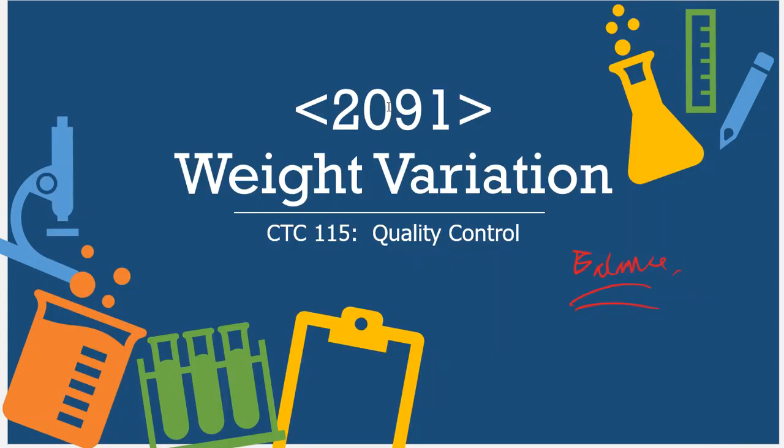All right, so that one's now finished. Weight variation of dietary supplements. Keep in mind, dietary supplements only of the USP-NF. And how we are okay with things being varied in masses. But still, there's going to have to be a limit. There's going to be a strict guideline on what passes and what fails. And it looks like 10% weight variation is going to be the judgment call.